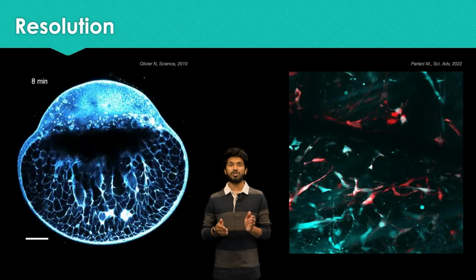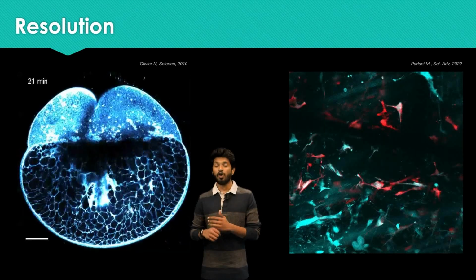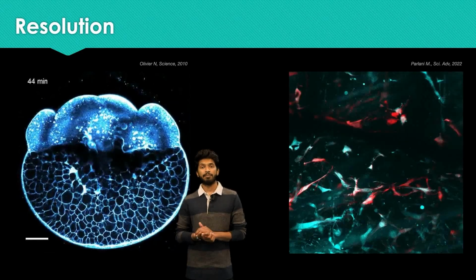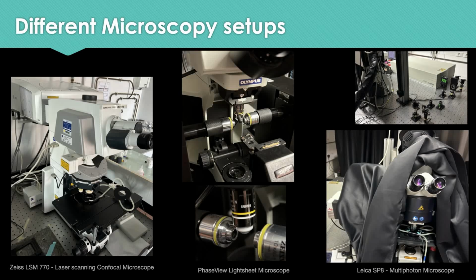High-resolution imaging is also often used to observe the impact of drugs and chemicals on different models, either in vitro, like in human or mouse cells, or in vivo, like in zebrafish embryos or in mouse. The efficacy, potency, and function of these drugs could also be observed over time. With the various advances in science, many types of setups have been built and optimized in microscopes. Each of these setups have their own advantages and their disadvantages, and these advantages and disadvantages are considered before observing a specific process or an event.